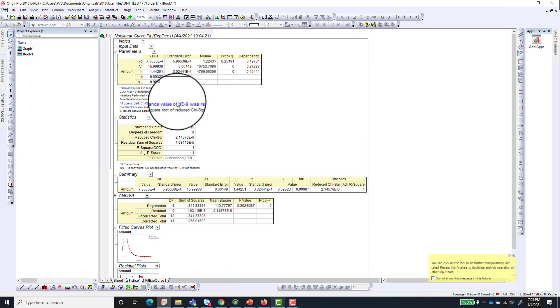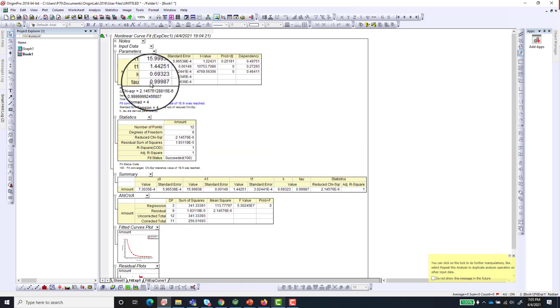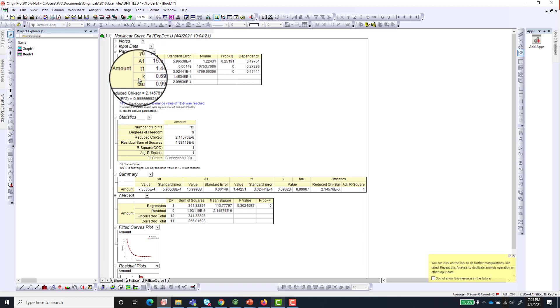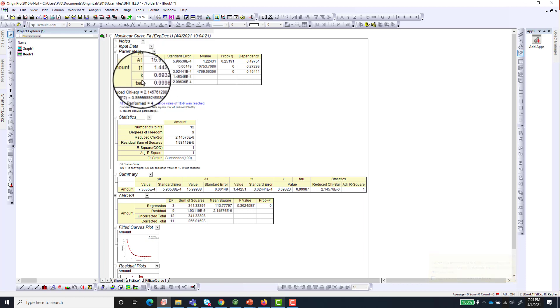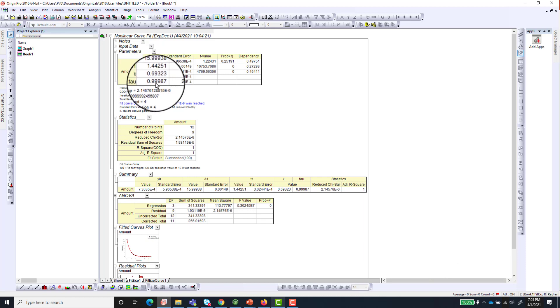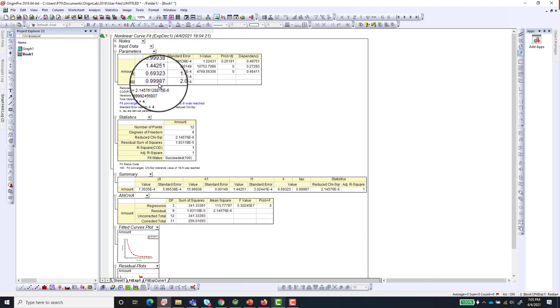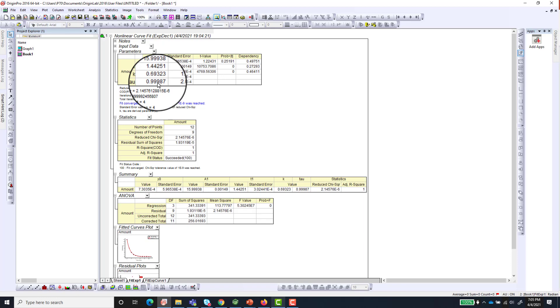And then you can see the decay constant which is k, 0.693. And then the half-life which is 0.99, which is approximately 1, so 1 minute.